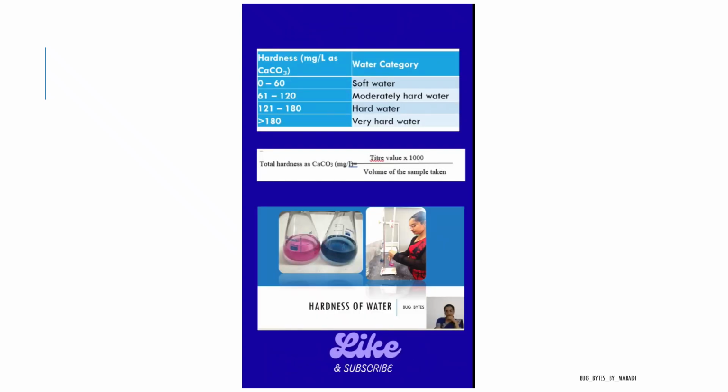This is the table. After getting the end point, that is the blue color, use the formula given over here. Just imagine 1.5 is the total ml. So 1.5 into 1000 divided by 50 ml of water sample taken, and you will get the result. Looking at that result, you have to classify whether your water sample is soft water, moderately hard or very hard using the table given.